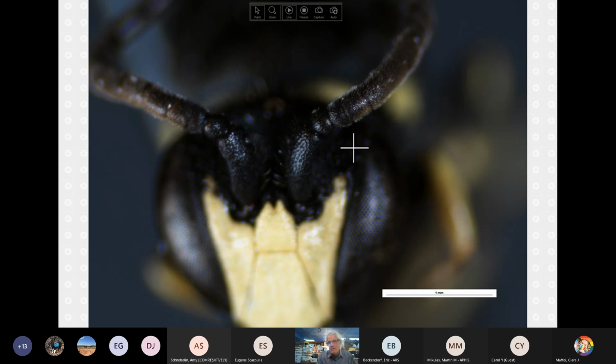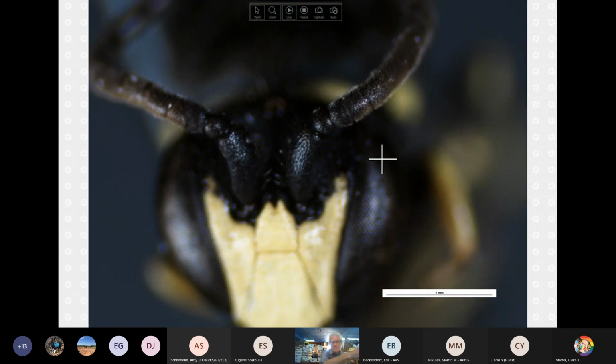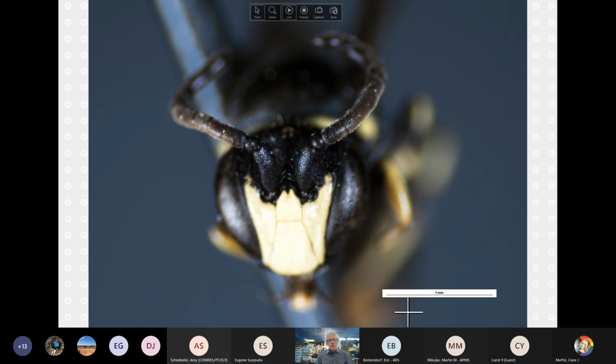And we'll show pictipes, an introduced species, but others have this too, where this is about the same, about halfway or less in terms of size. Subtle too. You can see that the scale doesn't change there. I have to change that on the program to meet the magnification I'm in. So I think that is largely what I'm going to talk about in terms of the facial characteristics. The mandible color and the labrum, which you can't see here because it's over the edge, their color is also useful. It's also in the guide as primary things.